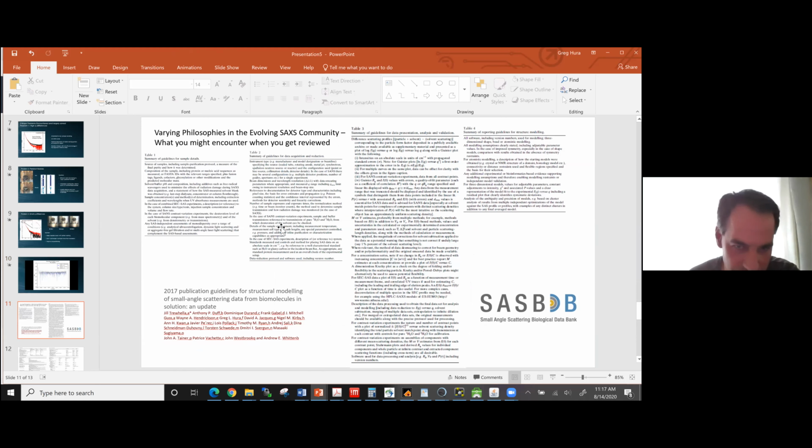If you were to truly fill these out for every sample, basically you fill up a whole paper for each sample. But it's good to read through and to see kind of an ideal case of how you would analyze the data and things to look out for and work for.